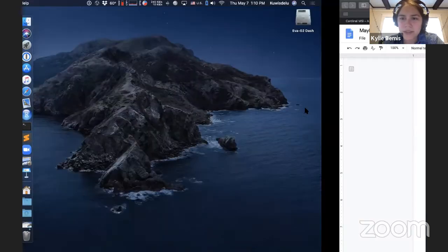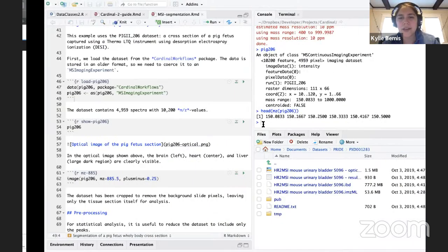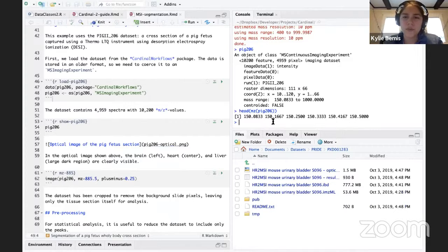So that's the best I can answer on that. We would store files in a continuous format really anytime when it's convenient to store the data like that. Ideally, we would get data into that continuous format before doing actual statistical analysis, because then it's much easier to access that data as a regular matrix.